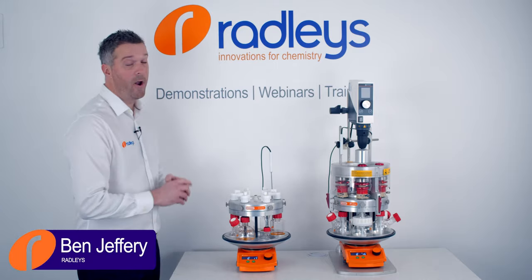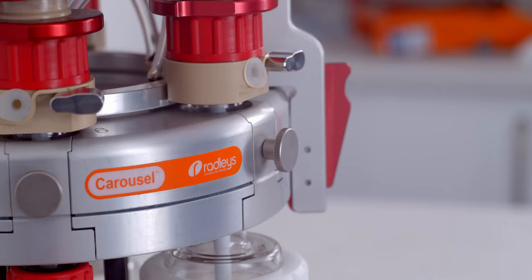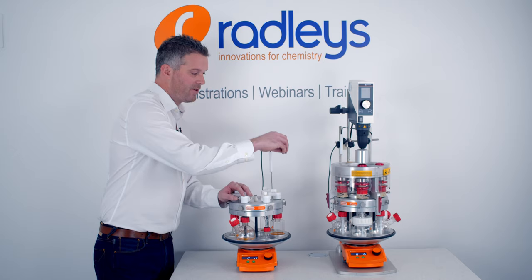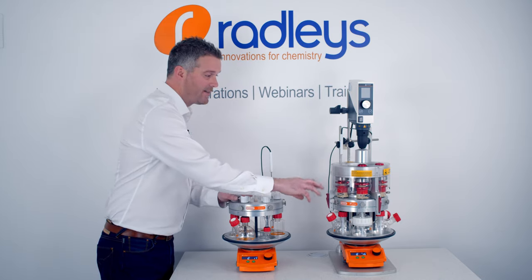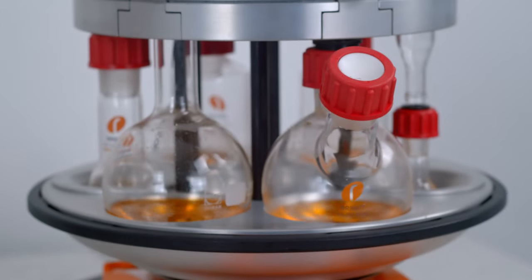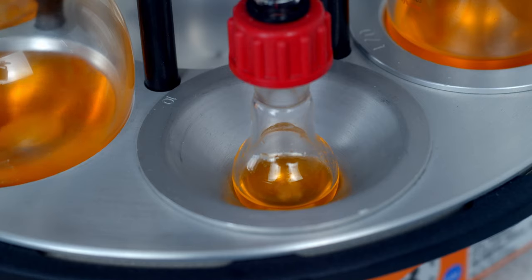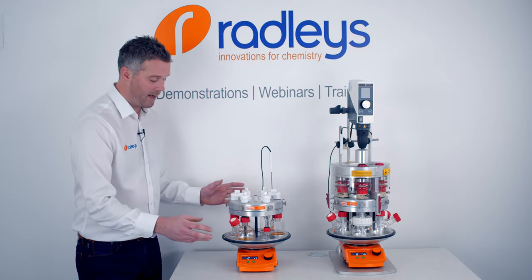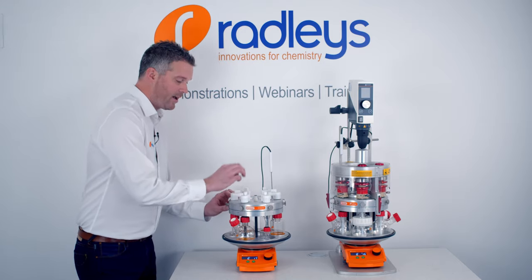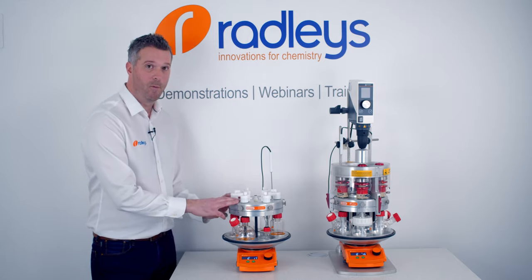Today we're looking at the Tornado Overhead Stirring System. The Tornado is an add-on for our Carousel 6 Plus system that allows overhead mechanical stirring in six flasks from one single overhead stirrer. With the Carousel 6 you can magnetically heat and stir up to six flasks from one single hot plate under reflux and inert gas. If you want more details on this product, check out our full product demo.